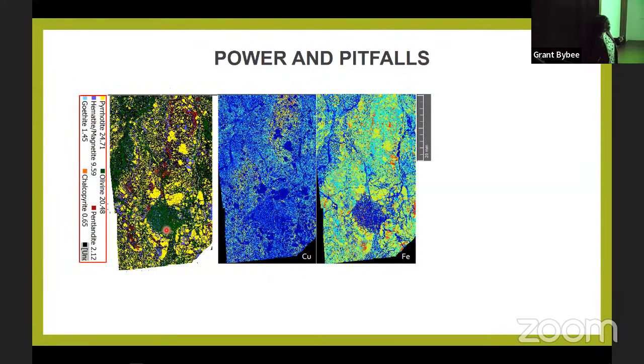And these ones are Bernie samples. They were analyzing the tracking. These are more olivine rich, and there's pyrrhotite as well. What I found interesting was the fact that the copper map shows some patches. You can see there's more of the copper here, whereas here there's nothing. And here's the iron map, also showing some variety of the samples.